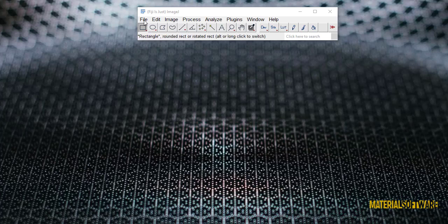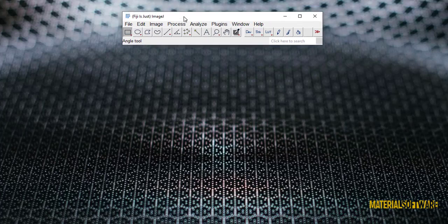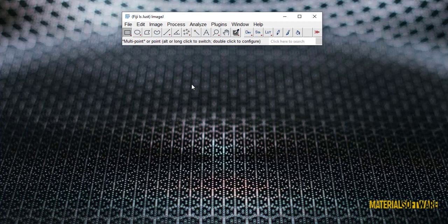Hello friends! In this section, we want to calculate the percentage of porosity in ImageJ software.